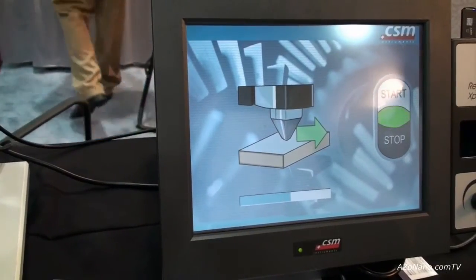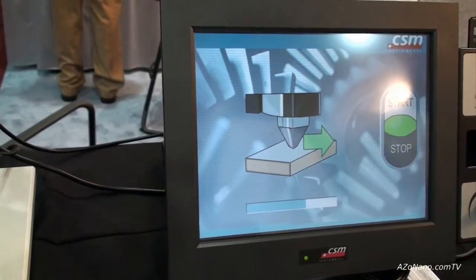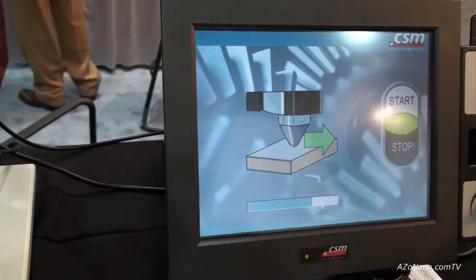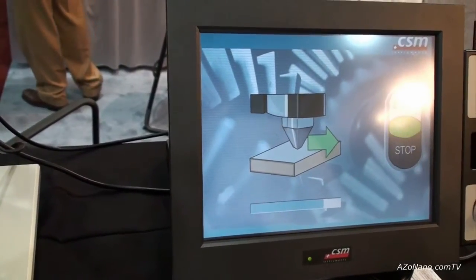We're doing a progressive load scratch up to 50 newtons and we're trying to see at what load the coating delaminates. What load do we actually have failure of the coating?